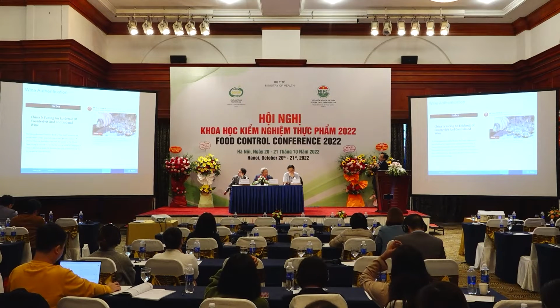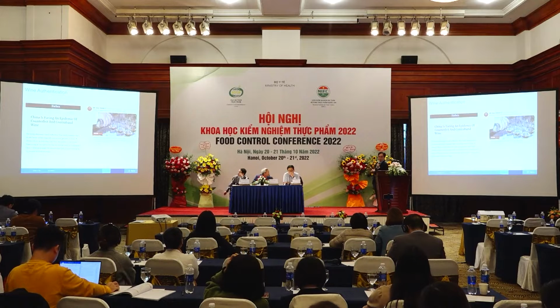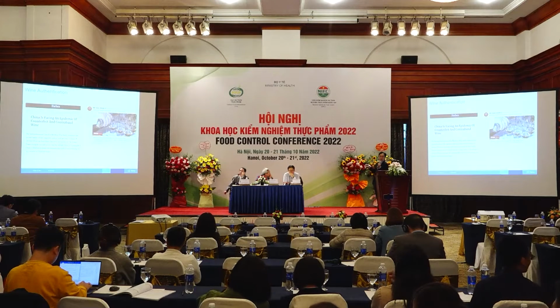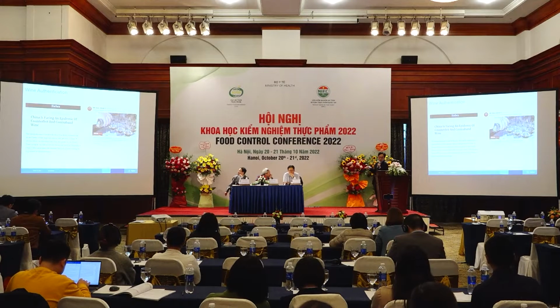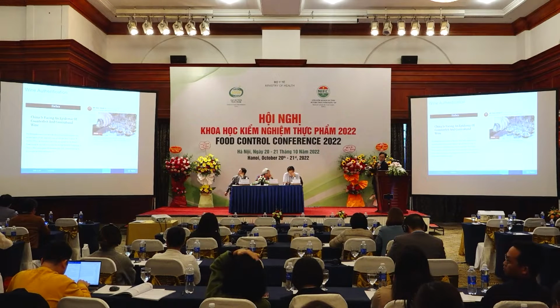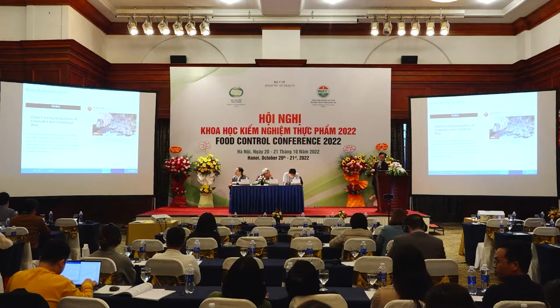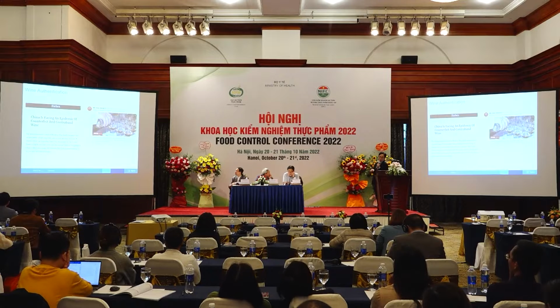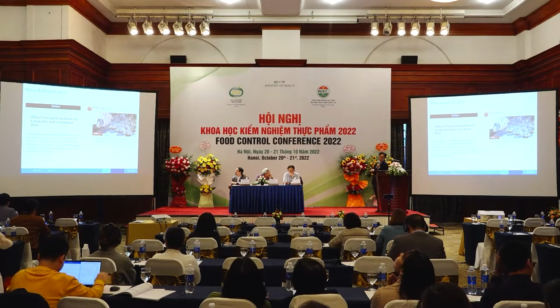Let me give you some examples and applications. Wine authentication. Wine is a big business. You can see in this news article that a lot of the wine being drunk in China is not labeled correctly. It is not labeled as to where it comes from. So this is a big issue regarding food fraud.